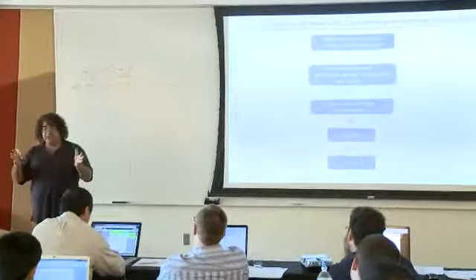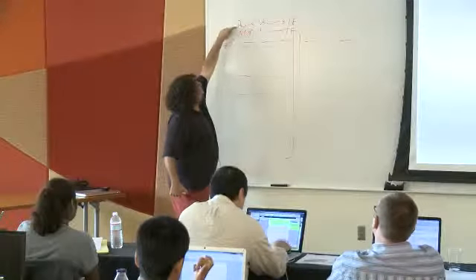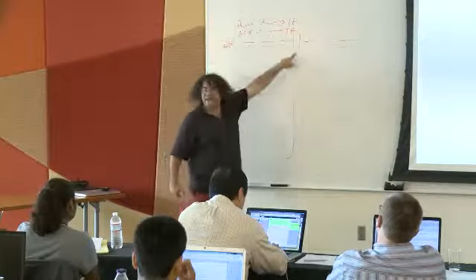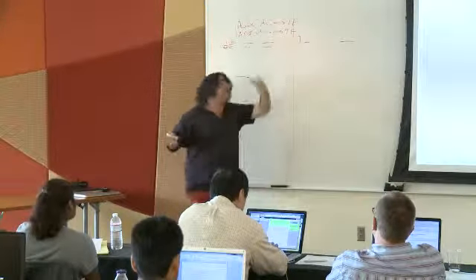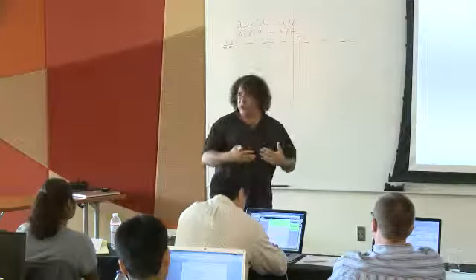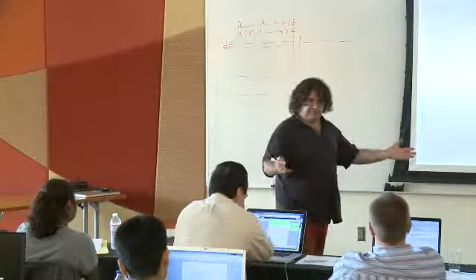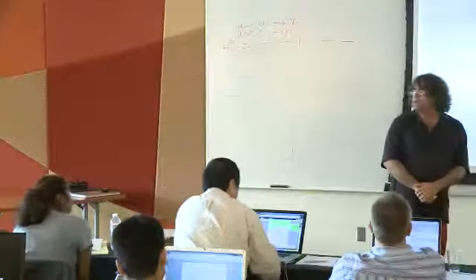But that doesn't mean that enhancers shouldn't subclassify as well. When you do these, you find enrichments. But when you go back and ask, of these 1,000 enhancers, how many of them actually have this motif? You'll find some percent of them, maybe 20%, maybe 40%. So there is definitely more going on there to take apart and find at higher resolution.